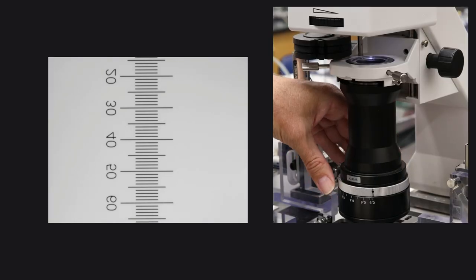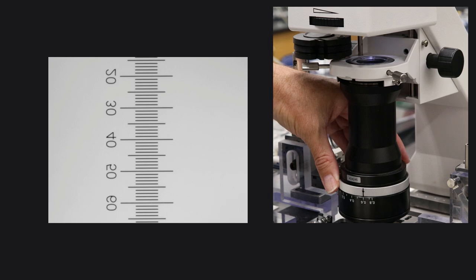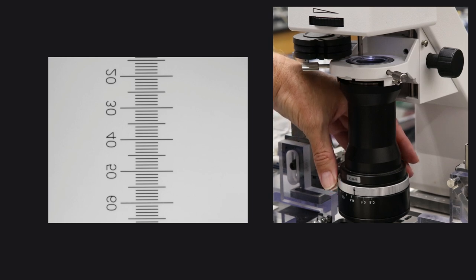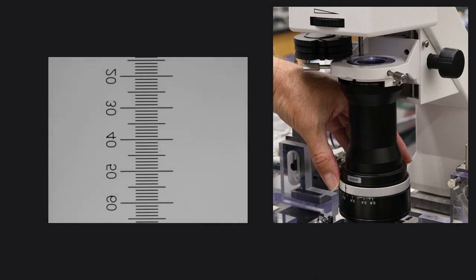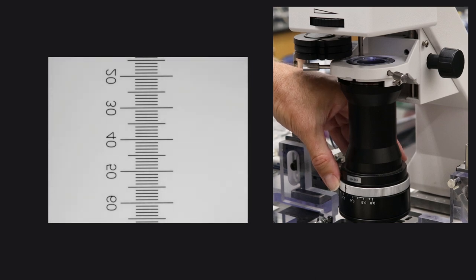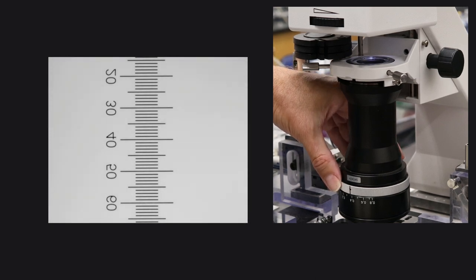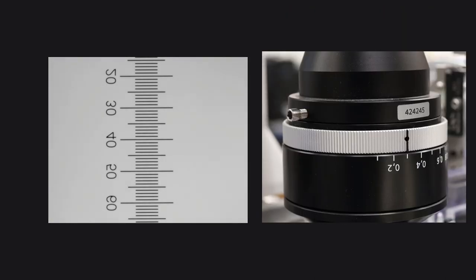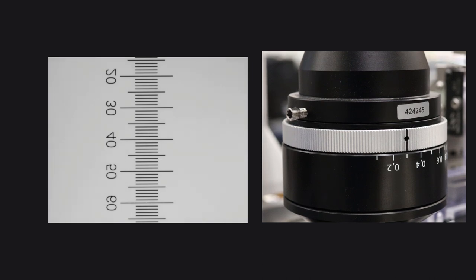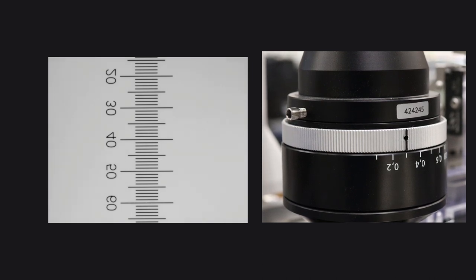Finally, let's find the correct setting for the condenser aperture. I first open it all the way and then gradually close it while observing the overall brightness of the image. The optimal aperture is the one where the image just starts getting darker. At this point, the adjustable numerical aperture of the condenser more or less matches the NA of the objective. And this concludes our setup of Köhler illumination.